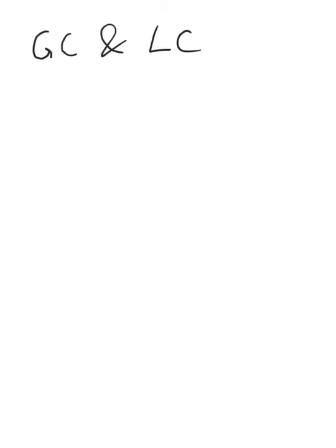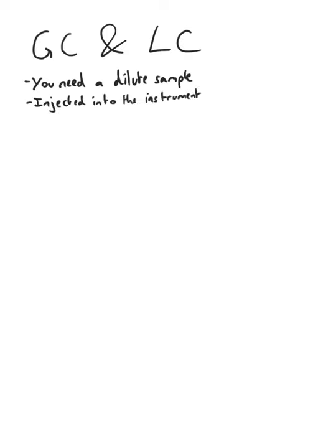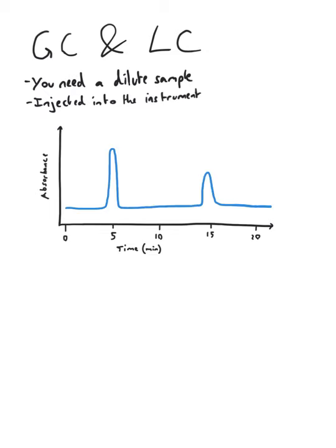This video is on gas chromatography and liquid chromatography. Your sample, whatever it may be, is diluted and injected into a gas chromatograph or liquid chromatograph. The data that comes out looks like this and is referred to as a chromatogram.